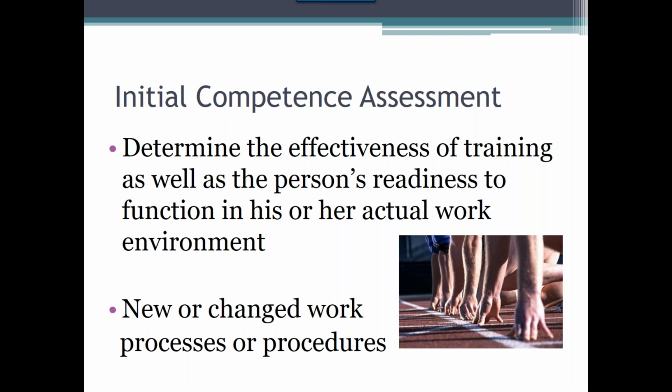Once an employee has been trained on a particular test system, it is good practice to perform an initial competency on the employee for that test system. Initial competency is used to determine the effectiveness of training, as well as the person's readiness to function in his or her actual work environment.